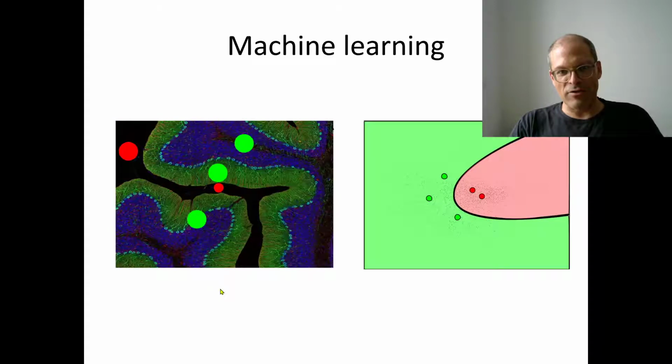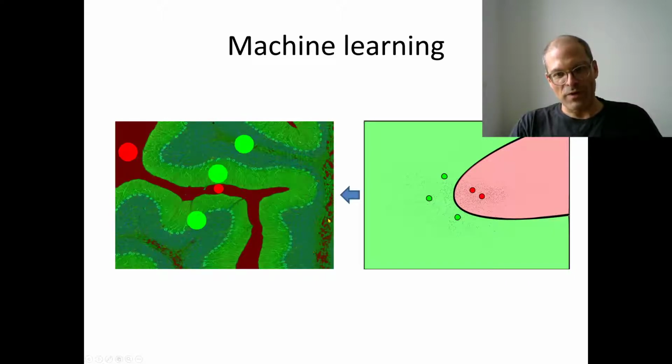So if we go back to the original image, you see that those parts here, yes, we understand that this is a part of the brain, but they are actually very dark, very similar to this background here. And so probably one would then want to give additional labels.